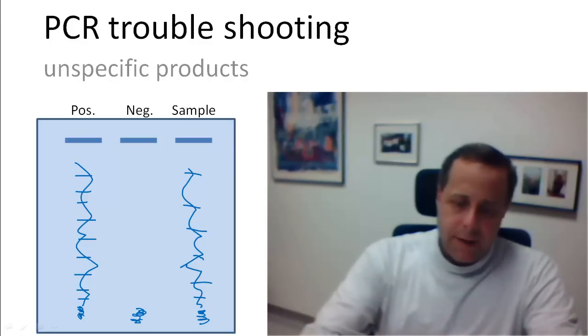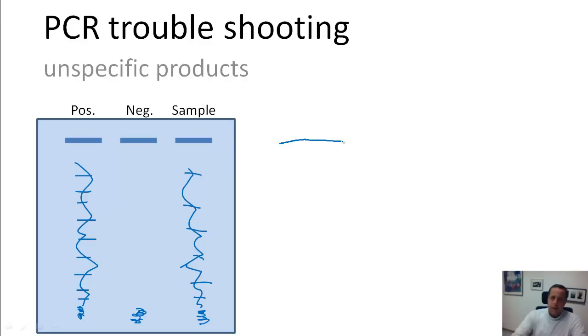So typically you get something like that. This is your template, and what you really wanted to do is to have your primers bind perfectly here and bind perfectly here, and this would then result in a PCR product to be amplified.